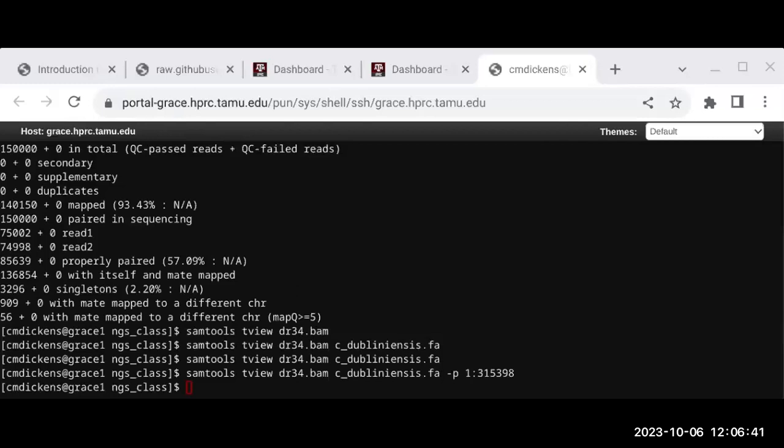If you have a large genome and you think it might fail, you don't want it to run for 4 days in the temp directory and then fail and have to start over. So you may want to just run it in the scratch. But in that case, you will need to request an increase in your file quota so that you can accommodate hundreds of thousands of files.